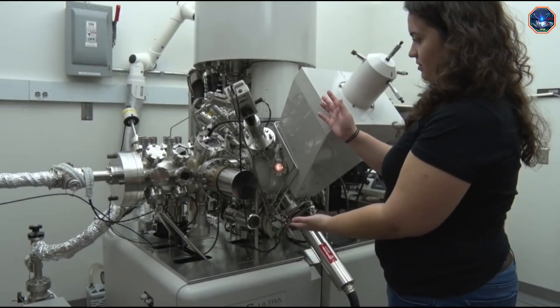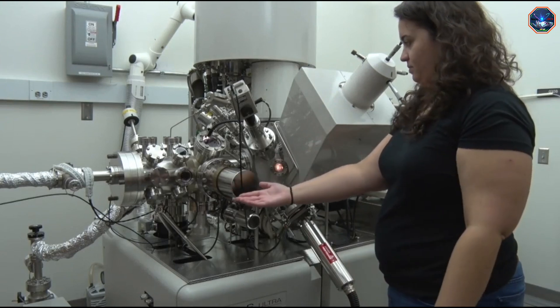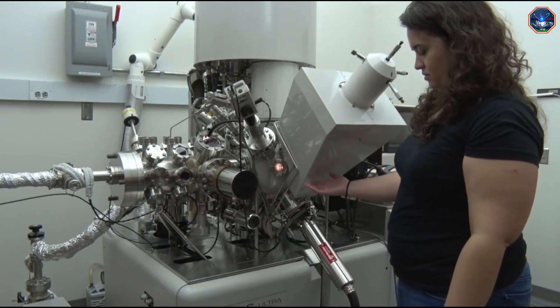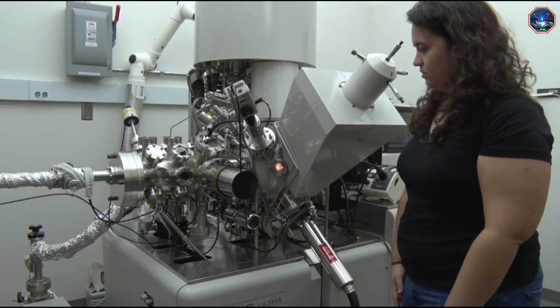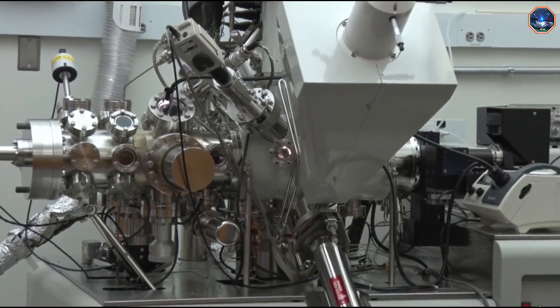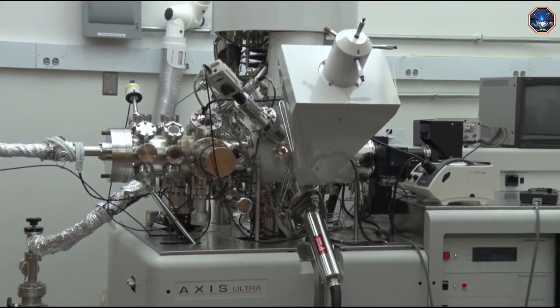This is the XPS chamber. It's a large vacuum chamber that's held at pressures in the 10 to the negative 9 torr range. Let me point out the important parts of the chamber to you before we get started.